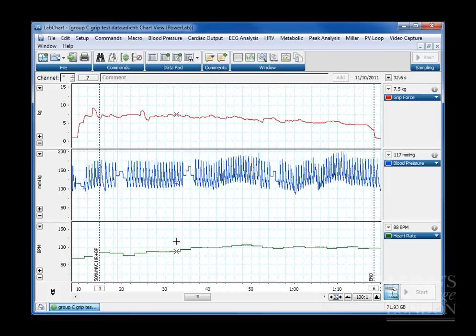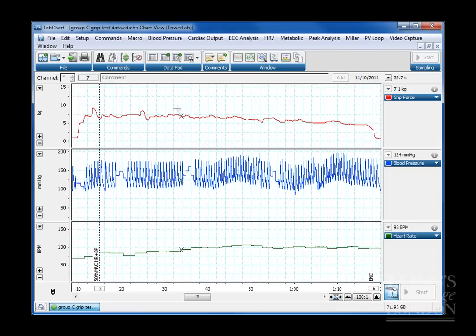The first of the data sets we're using is this data set. This is isometric exercise using a hand grip dynamometer. This is three sets of data acquired by this system.